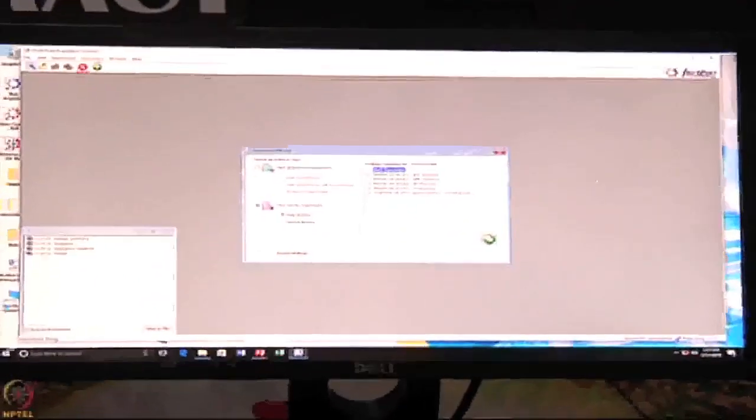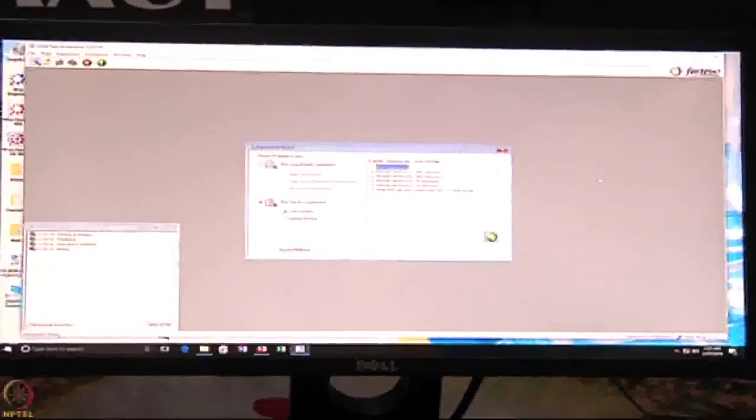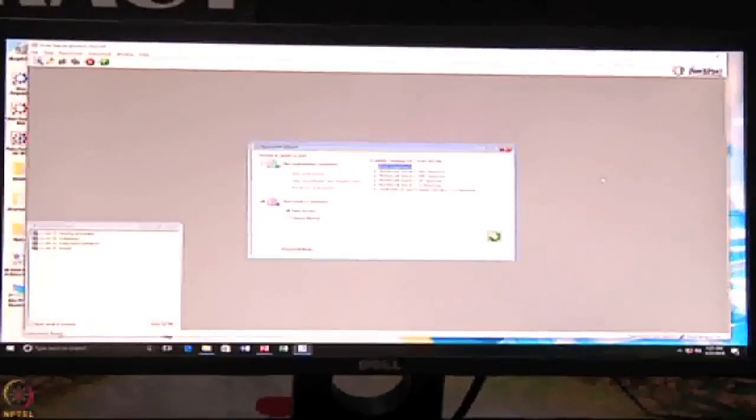Using this, I will take a blank experiment. There are some inbuilt templates, but the best way is to go for a blank experiment, where you can make your own template format. If you know how to make your experimental design in a blank template, it's very quick. So I will click go here.